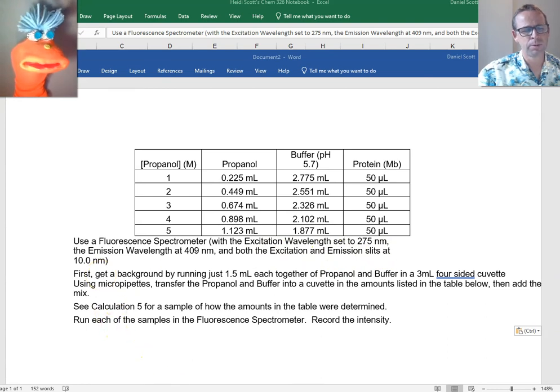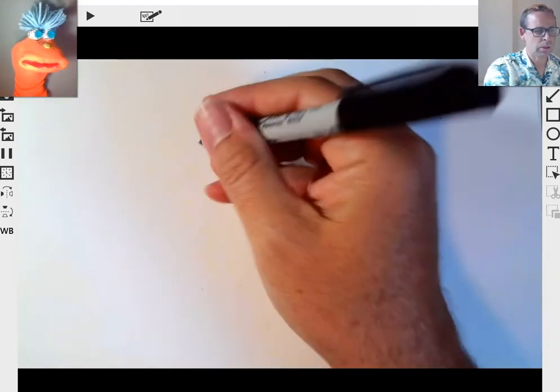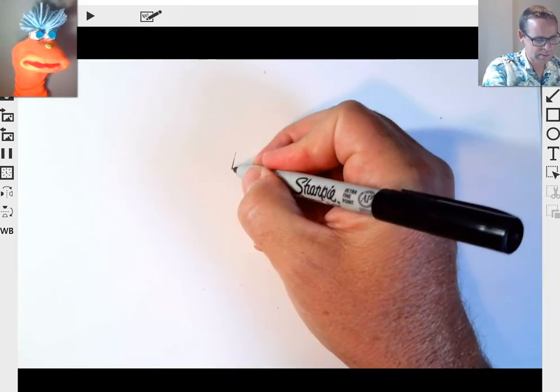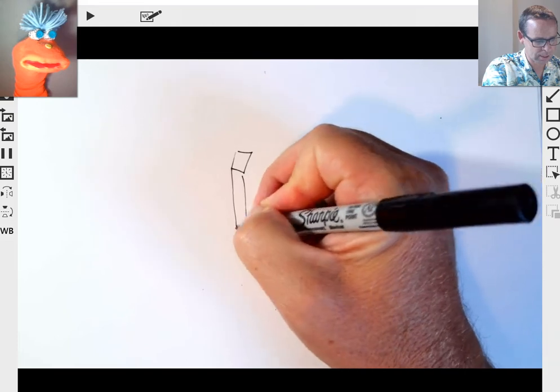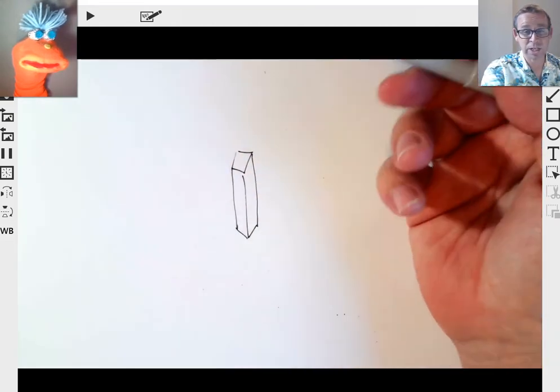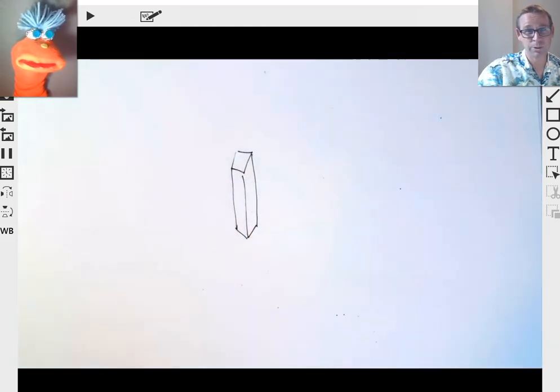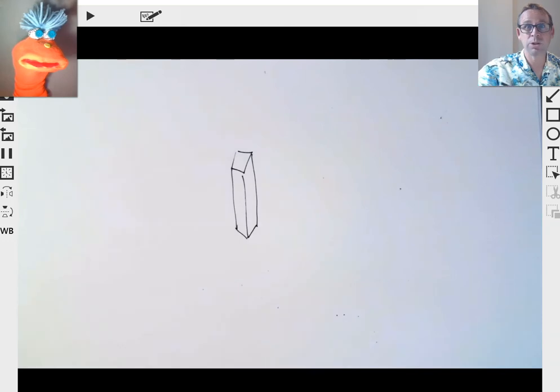No, I don't remember. Well, in a fluorescence experiment, the different amounts of fluorescence can change significantly from sample to sample. You can get intensities of only 1, 10, 20, something like that, but you can also get really, really high intensities.